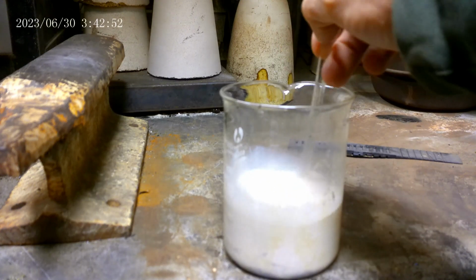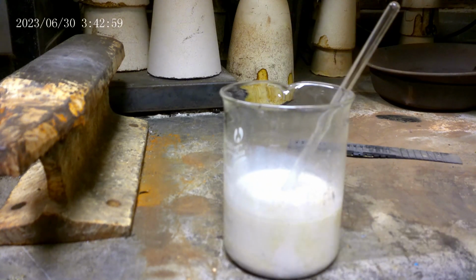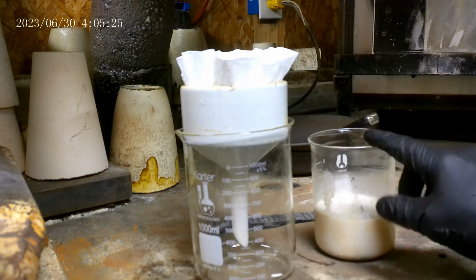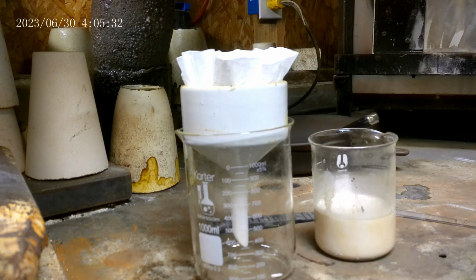Yeah, so we'll let that cool off. See if the color changes. Let it settle a little more, and we'll dump it through a filter and recover everything. We'll give it a slight roast to dry it off, get it in the furnace and smelt it, see if we get any better gold than we've been getting. Okay, my hood fan's a little loud, but I'm going to dump this into this filter. I'll probably have to rinse it once or twice and dump it and see what we get.